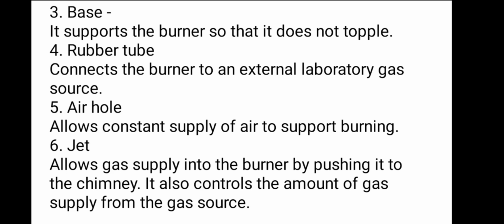We have the air hole. Remember I showed you a few minutes ago. We said the air hole allows a constant supply of air to support burning. When it is widened, more oxygen is allowed in, and we know oxygen is a gas that supports burning. So the wider the hole, the more supply of oxygen. The narrower the hole, the less supply of oxygen into the burner.